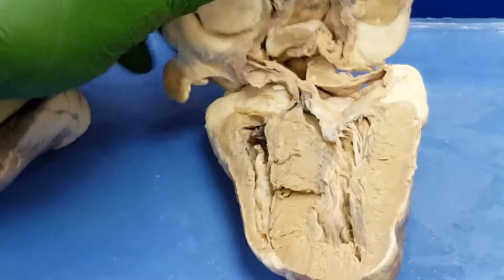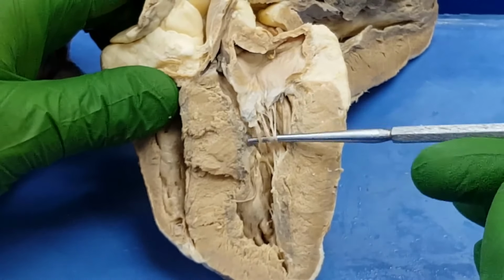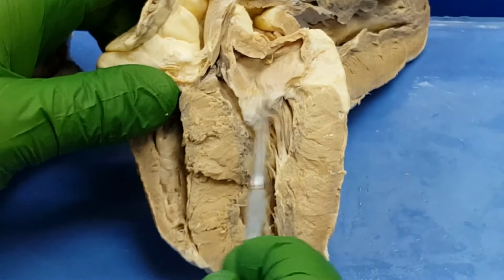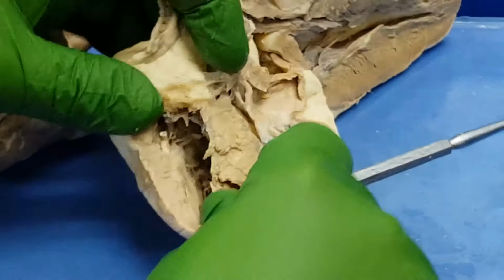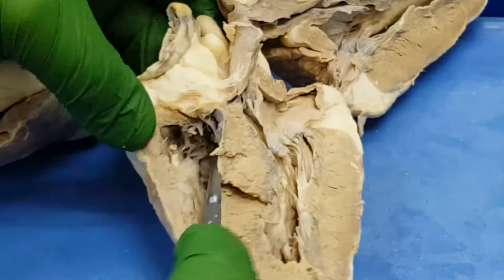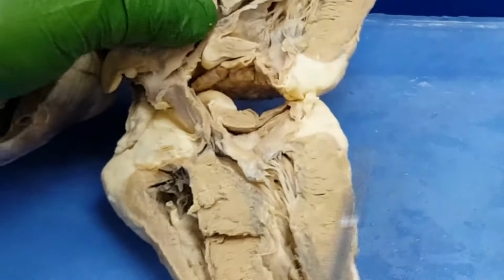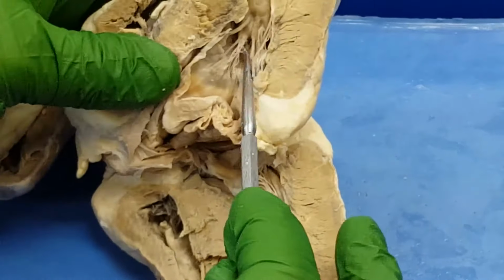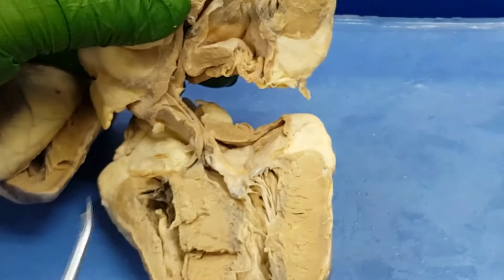And in this larger sheep heart, I can see the same. See the cords? Follow them in a superior direction, and this is a flap, one of the flaps of the mitral valve. Right there. This valve is the mitral valve. Look at the cords. Over here, if I expand this out, I can see some cords here. They're a little bit chopped up, going up to the tricuspid valve, which is right here, separating the right atrium from the ventricle. Look at the back side up here. I can see those cords, see how it closes. These are the cords and the other flap of the mitral valve.